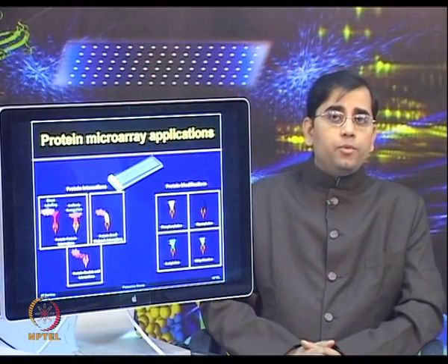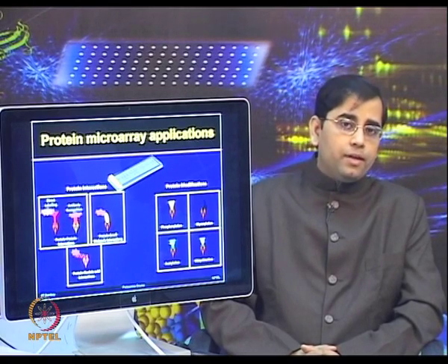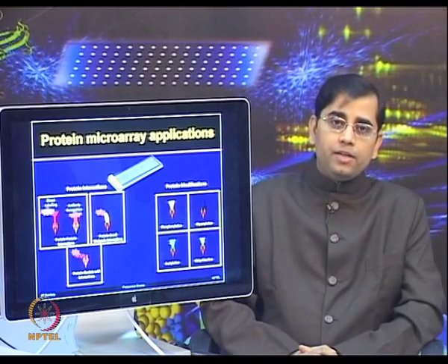In general, protein microarrays have been widely used for biomarker identification. They have also been used for studying protein-protein interactions as well as various types of protein modifications.